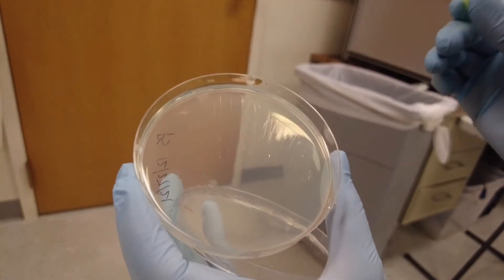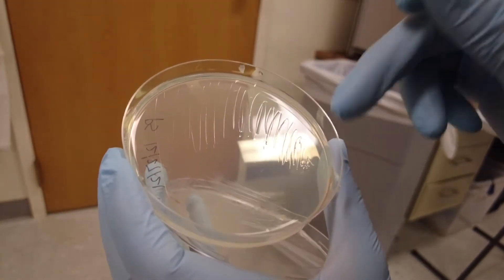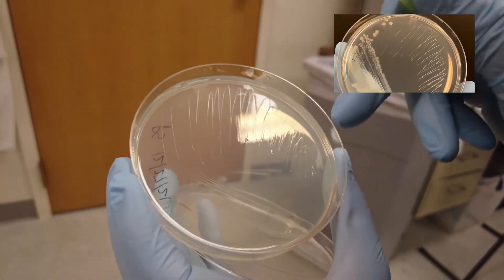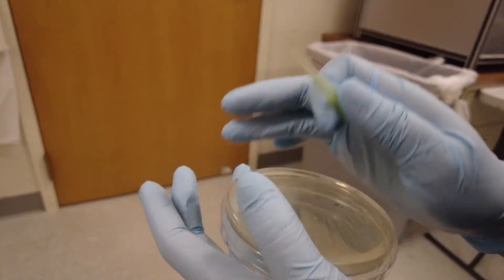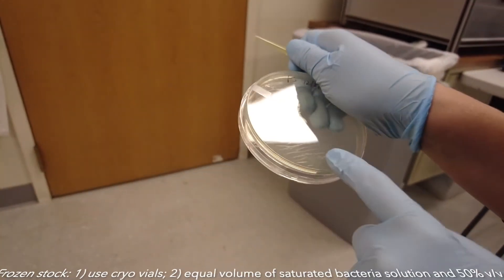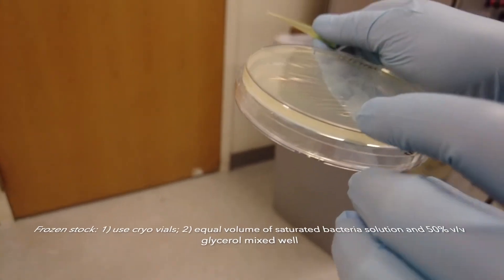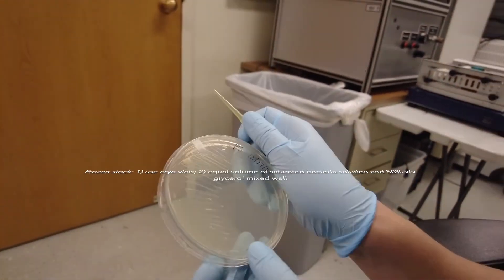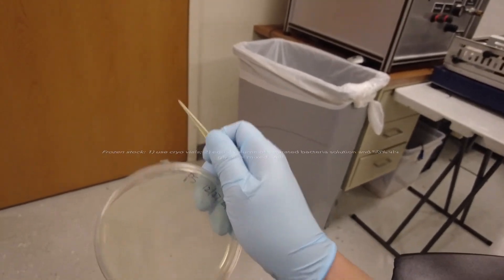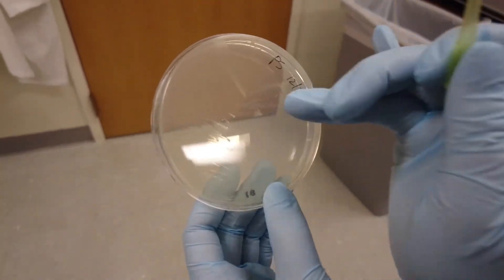What this does is that it will give you single colonies, and you can see if they grow up differently. If you ever have contaminants, you can pick up the single colony of the bacteria that you wanted and save another stock. Hopefully you'll never need to do that, but this is how you streak out for single colonies.